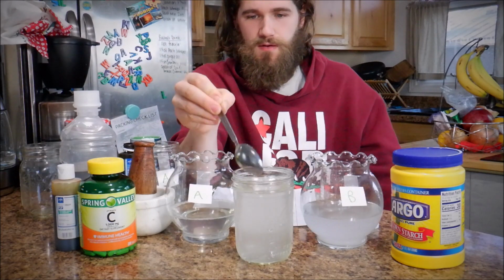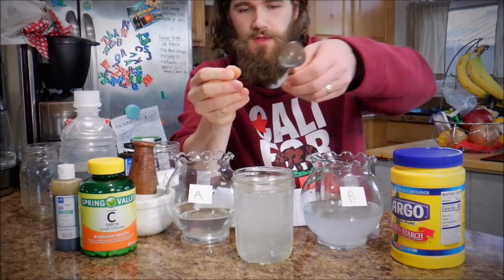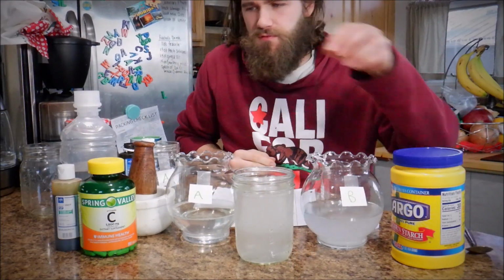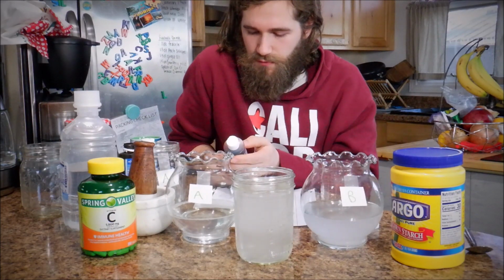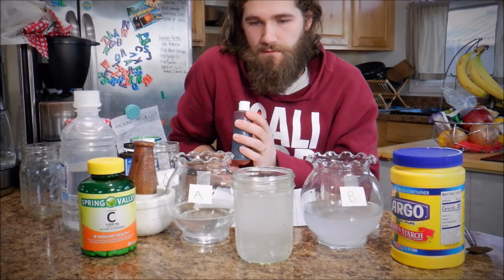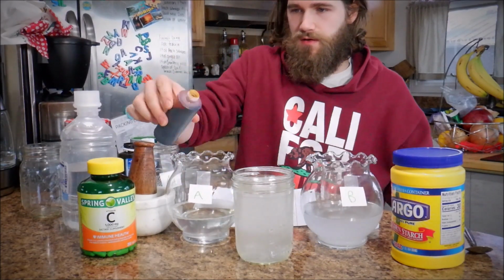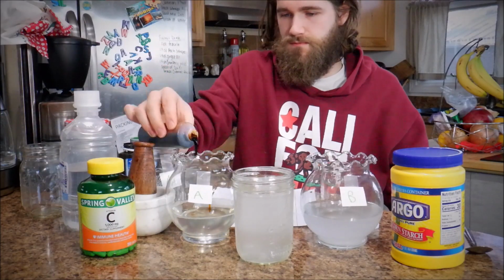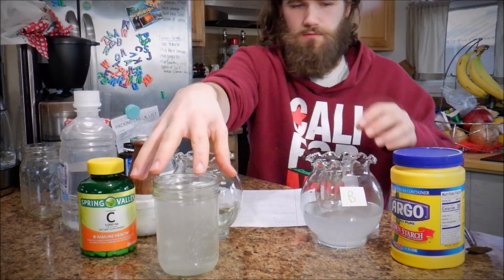Now this may not be changing because of the povidone iodine that I'm using. Oh, let's see. Equivalent to 1% available iodine, so I might need more of the povidone iodine than I thought.